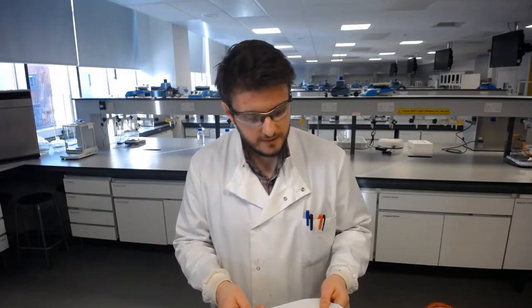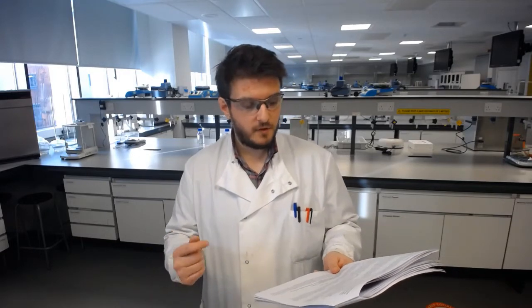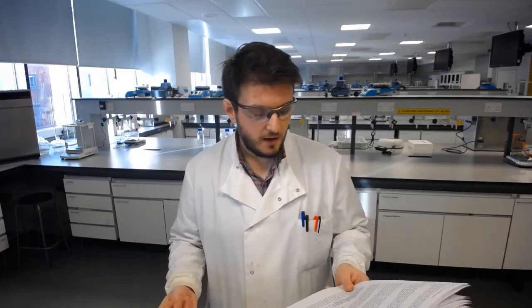If you refer to your lab script, you'll see that I go into some of this in a little bit more detail. I then go on to talk about Stokes' law, which outlines all of those factors that we can change to influence how fast something falls out of solution. We have the formula in your lab scripts, where the velocity, the rate of sedimentation, is equal to 2 times the gravitational force, which we can't change, times the radius of the dispersed solid particles squared, times the difference in the densities of the dispersed and continuous phases, all over 9 times the viscosity of the solution.